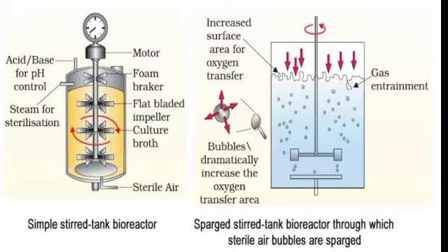Whereas in the sparged stirred tank bioreactor, sterile air bubbles are sparged inside, which is being let inside. This increases the surface area of oxygen transfer. So the bubbles will increase the oxygen transfer area.